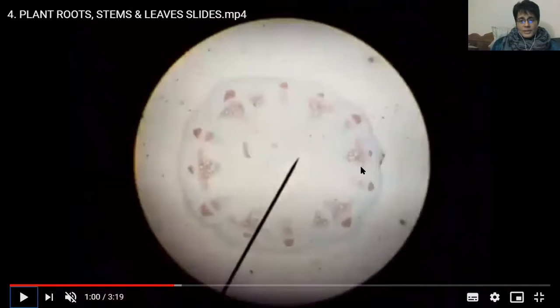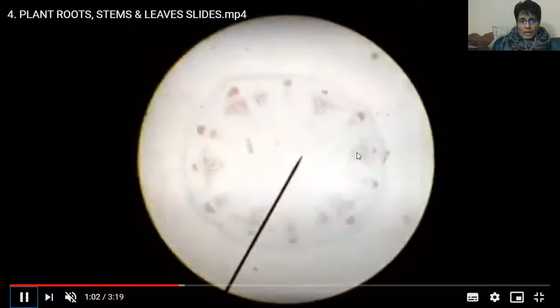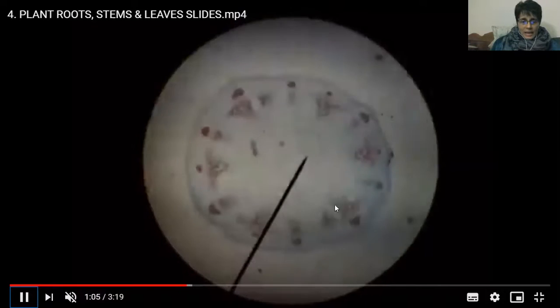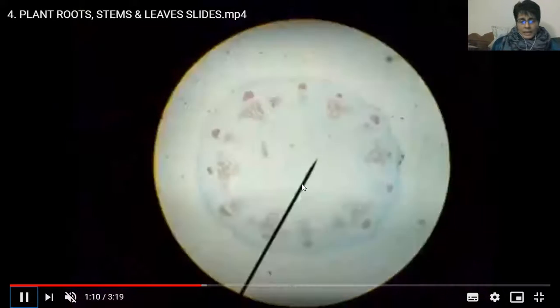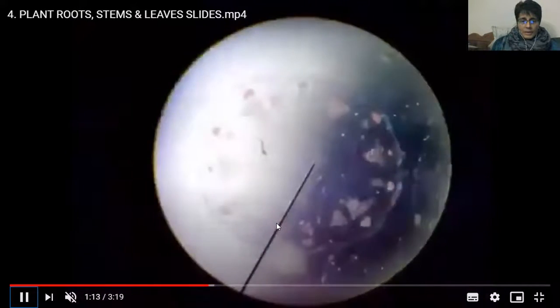Okay, now this is a transverse section through a stem. You should recognize it. There are the separate veins. Look there, sclerenchyma on the outside, there's xylem, and somewhere there is phloem. It's not very clear. This is low magnification. You can see the cortex of parenchyma on the outside. There's the epidermis somewhere on the edge, and here's the parenchyma pith. So this pointer is pointing to the parenchyma pith in the middle. You can even see some of the larger xylem vessel cells. Okay. And on the edge, maybe some parenchyma cells.